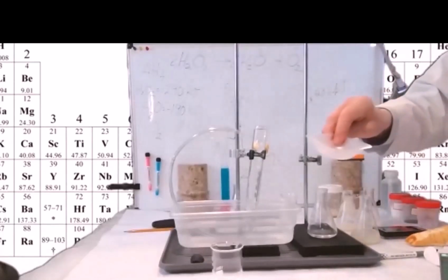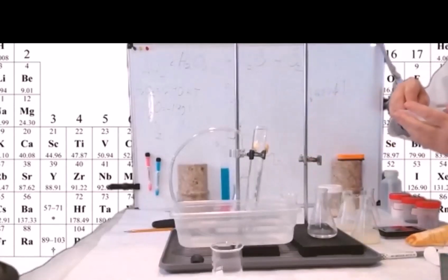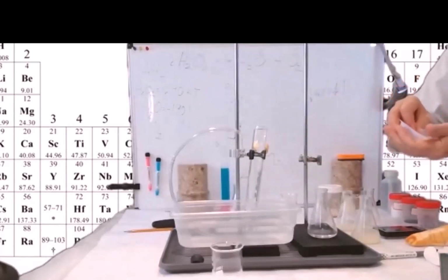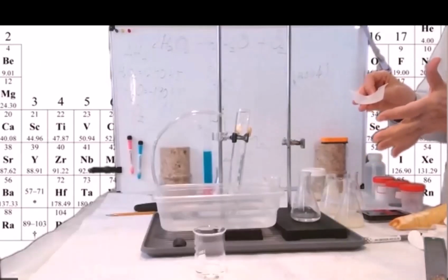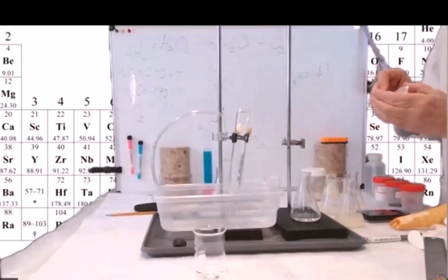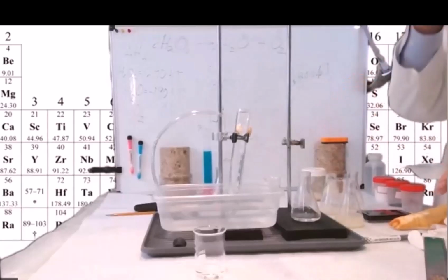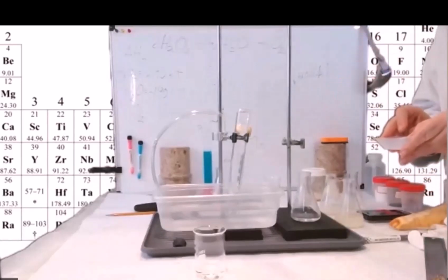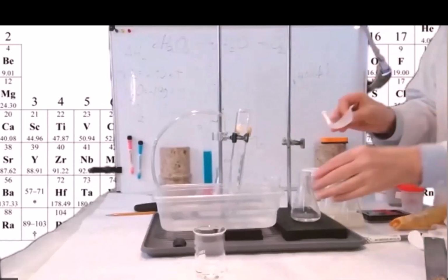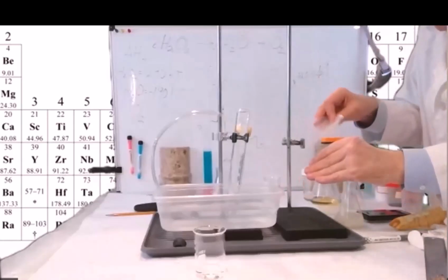And here I've got 0.6 grams of potassium iodide, which is an excellent catalyst. There are a lot of catalysts for hydrogen peroxide. Potassium iodide, KI, is one of them. And this one's good because I don't have to worry about heating, because this is an ionic compound and I'm not going to denature an enzyme heating it, so that's not going to be a problem. And I'm going to dump this in here, dissolve it quickly.